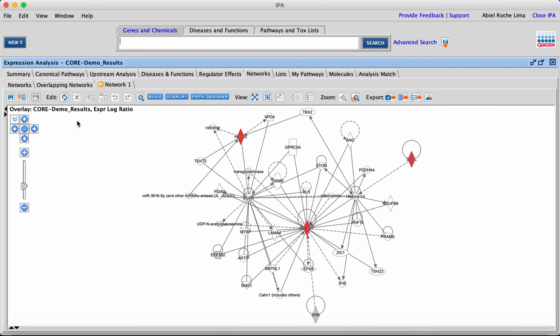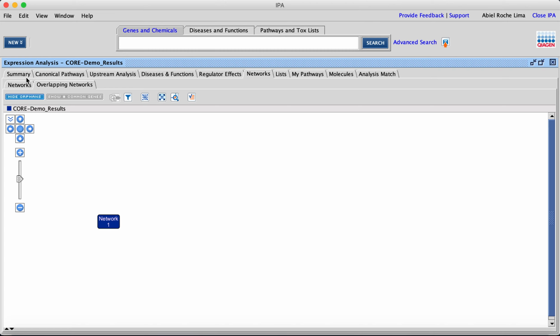Of course, this is getting more complex, so that's why it's very important to be specific in the networks you want to display, because the bigger the networks, the more convoluted it is to understand and analyze. So it's good to work with a small data set, small nodes, so it can make more sense with less.